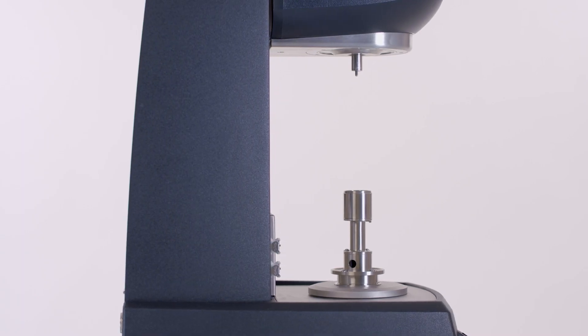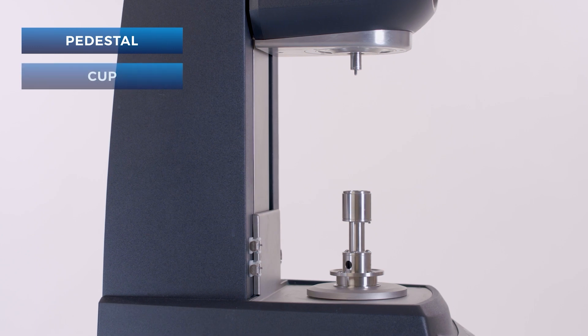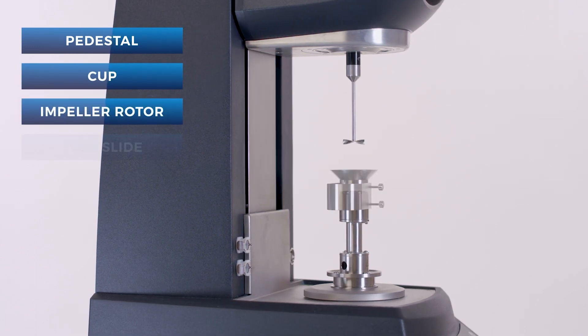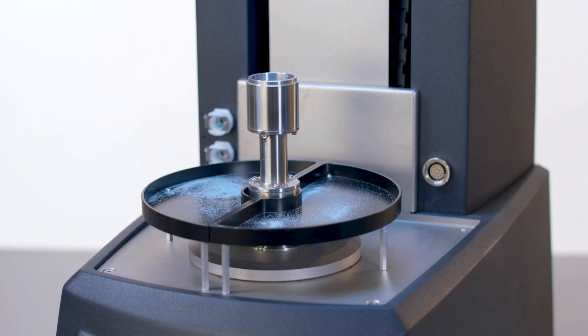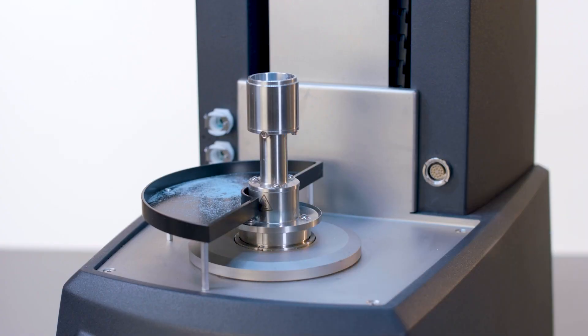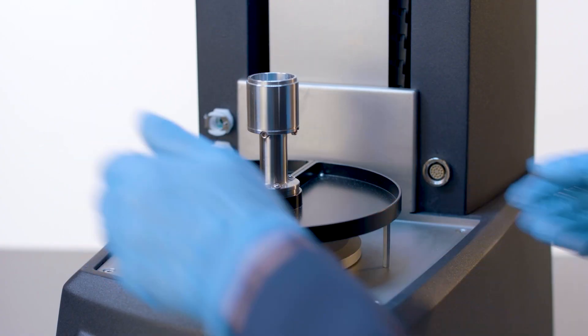The flow cell accessory consists of the pedestal, cup, impeller rotor, trim slide, trim funnel, and catch tray. The catch tray is placed around the pedestal to catch powder for easy cleanup.